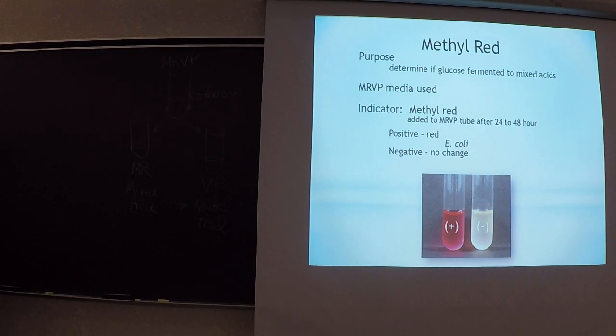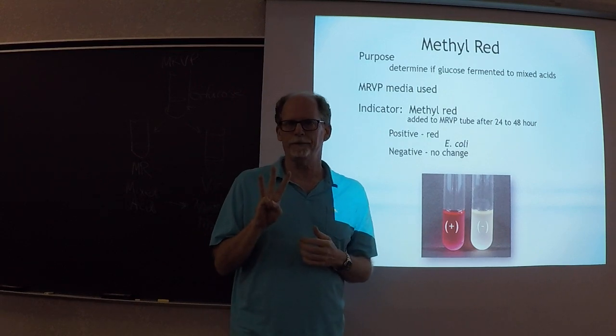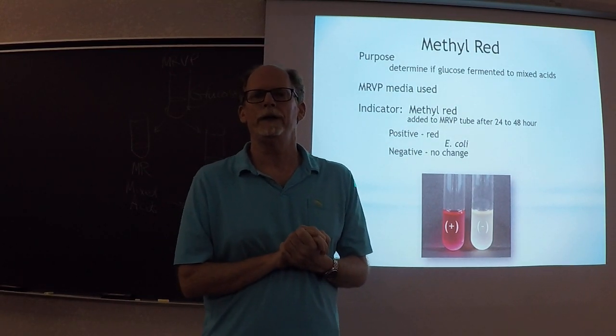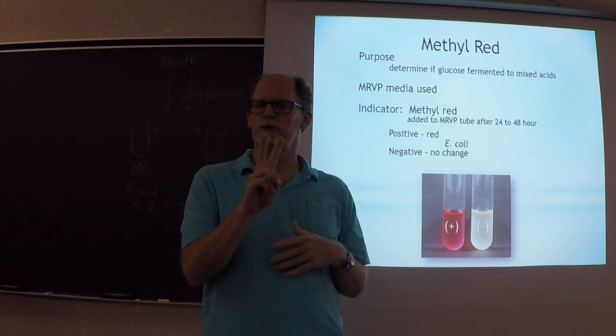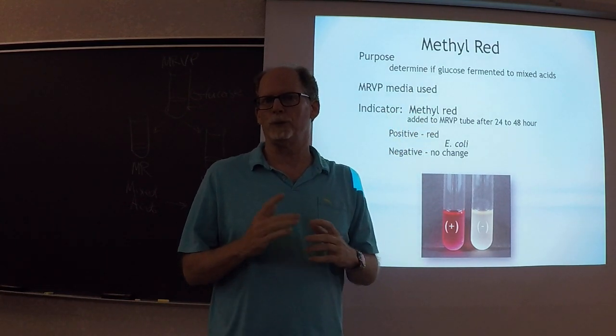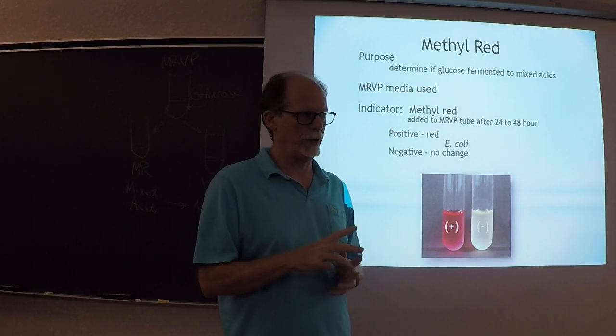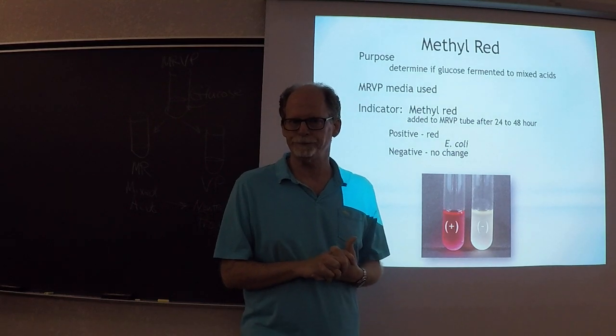Alright, so this is video 3. We're doing 3 different tests. The MRVP, which consists of 2, the MR or methyl red test, and the Voges-Proskauer test or VP test. And then the third one is called the citrate media.